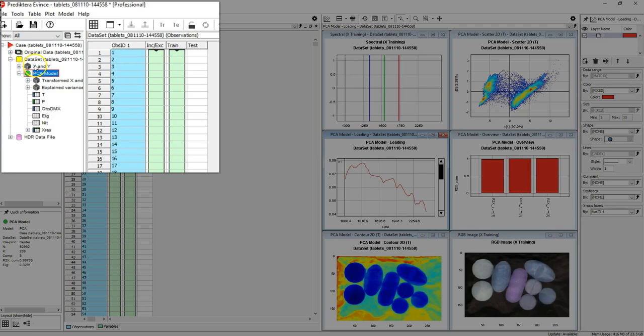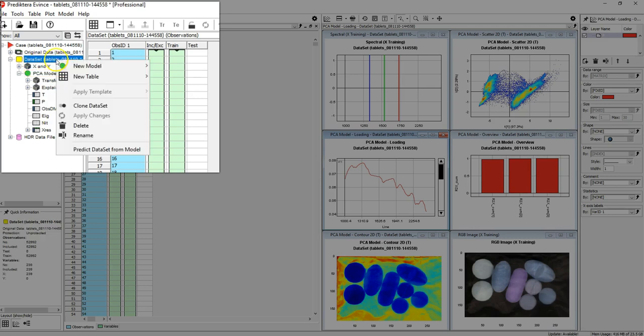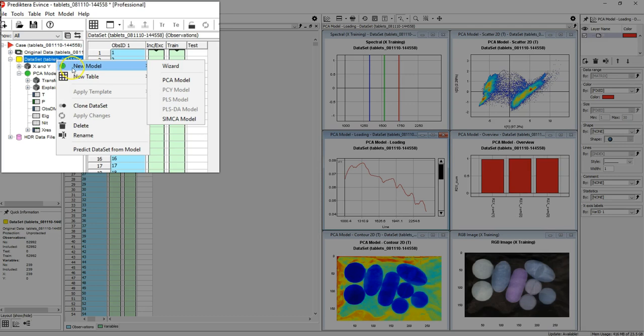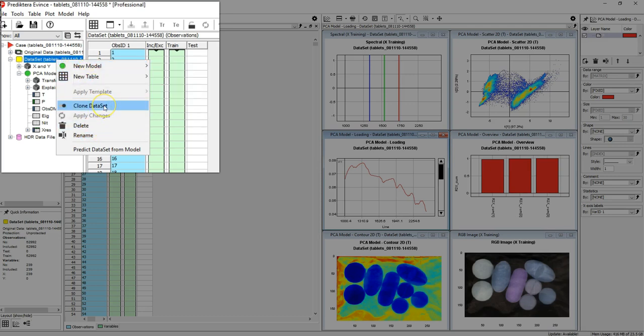If you right click on an item, you will see many options. For example, to create a model, rename or clone a dataset.